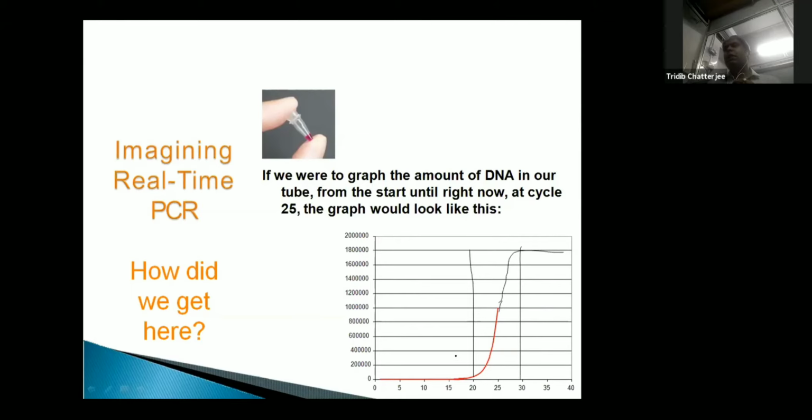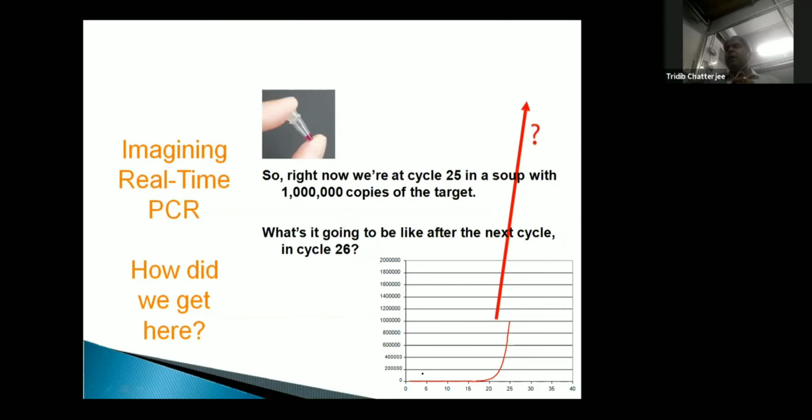So it's called the sigmoid or S-shaped curve, and typically this shaped curve is called a complete or good PCR reaction. Why did this happen? We'll try to understand this. The reason is that in the initial phases of cycling the amplification is happening, but the amount of doubling is so small that it is not visible on the scale.